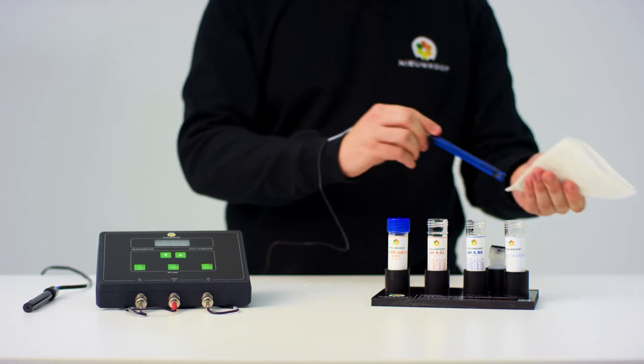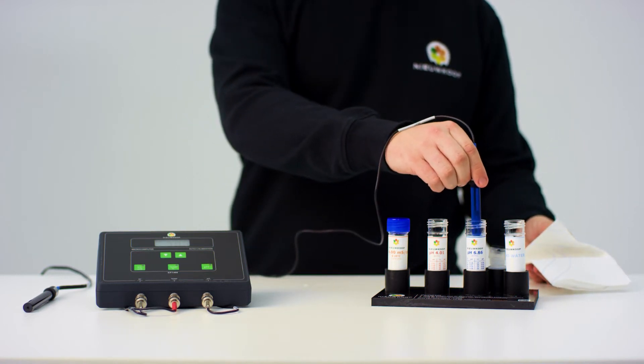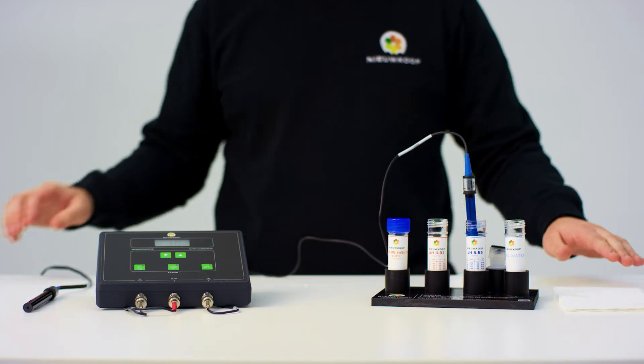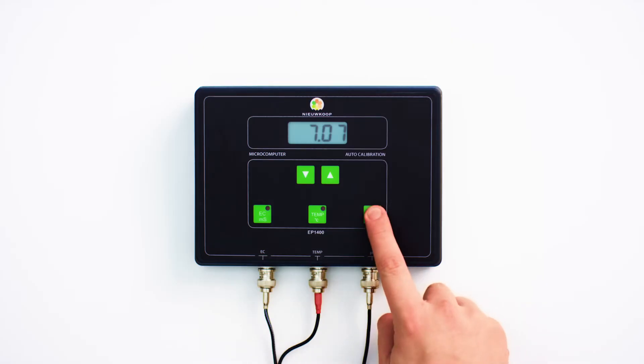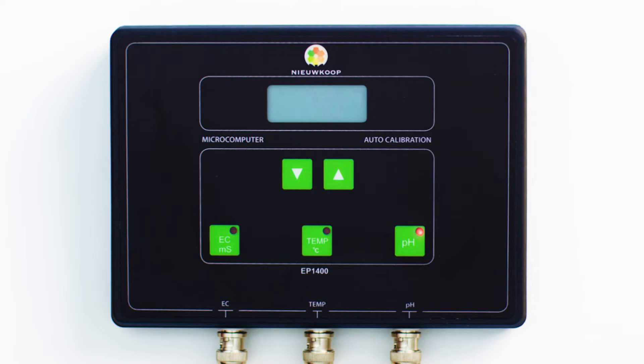Now place the sensor in the tube with pH 6.86 liquid. Stir briefly to remove any air bubbles. Press and hold the pH button until 'cal' appears on the display. This is followed by the text 'pH 1'. The reading will blink and the tilde sign will appear in the top left of the screen. As long as this is in the display, the instrument is calibrating.